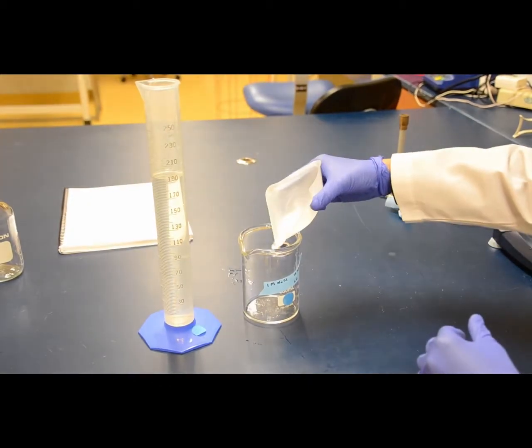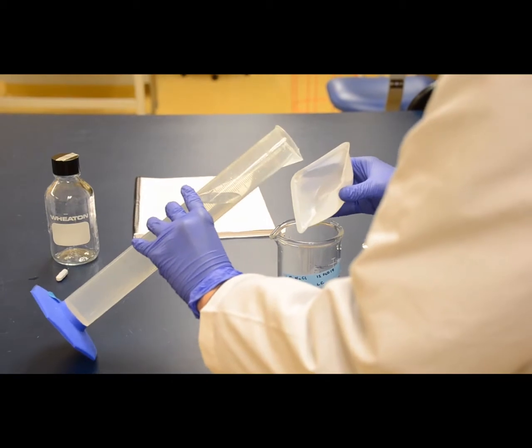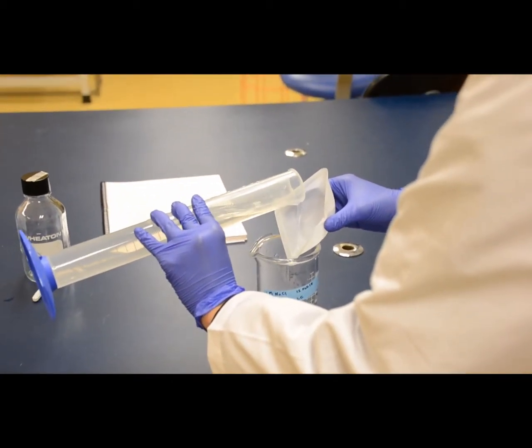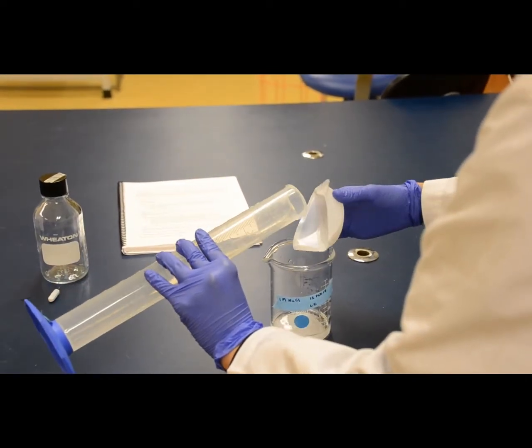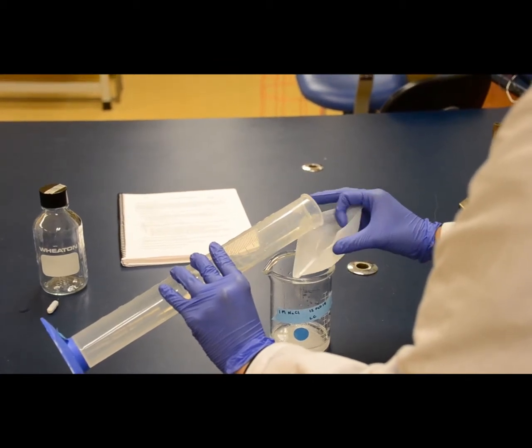And now you can add the solid to your pre-labeled beaker. There will likely be some solid that remains in the weighboat. As you add water to the solid in the beaker, carefully pour it over the weighboat to get that leftover portion into the solution. This is important, otherwise the amount that you weighed out isn't what you added in.